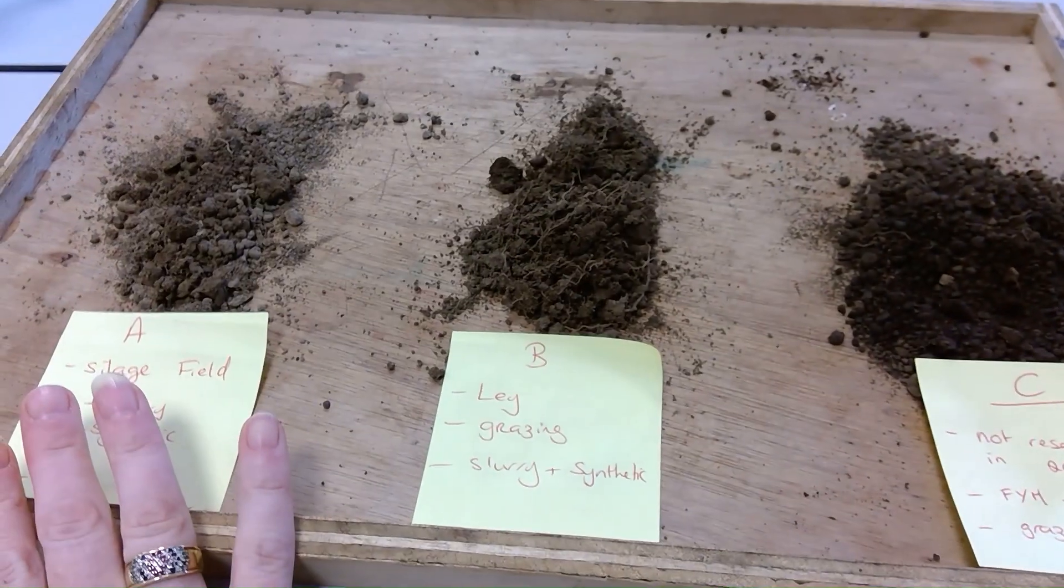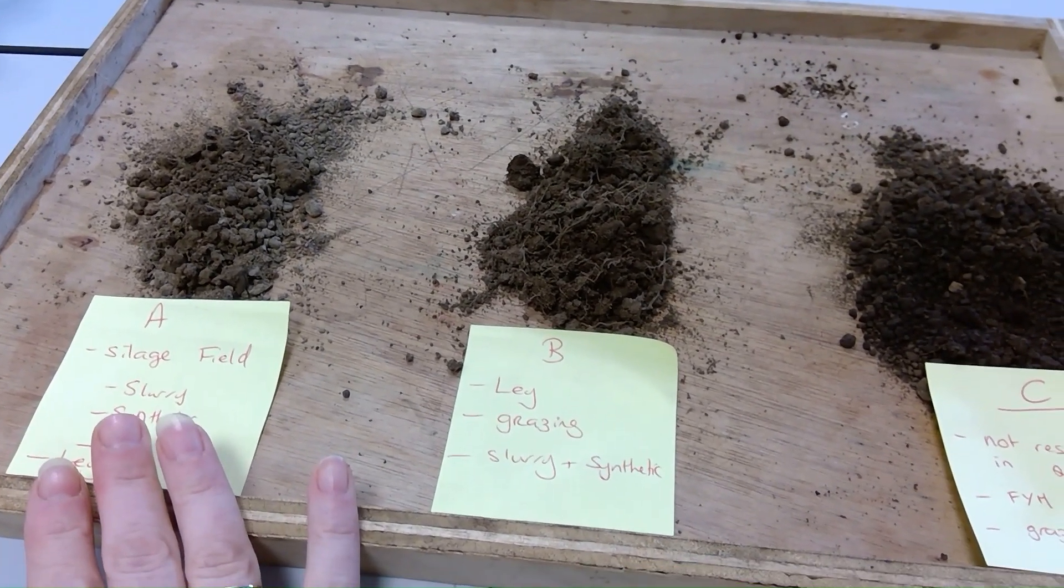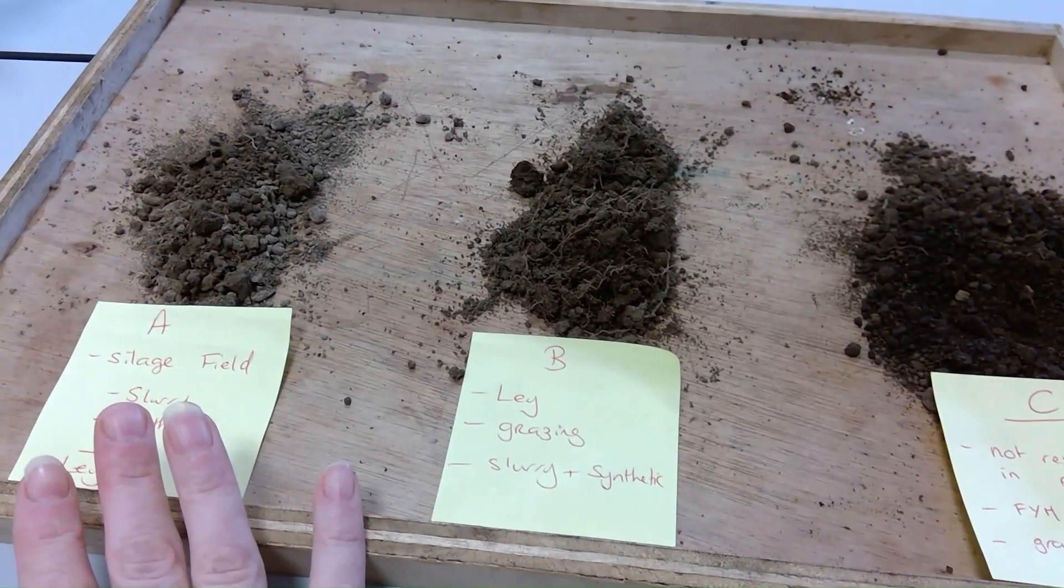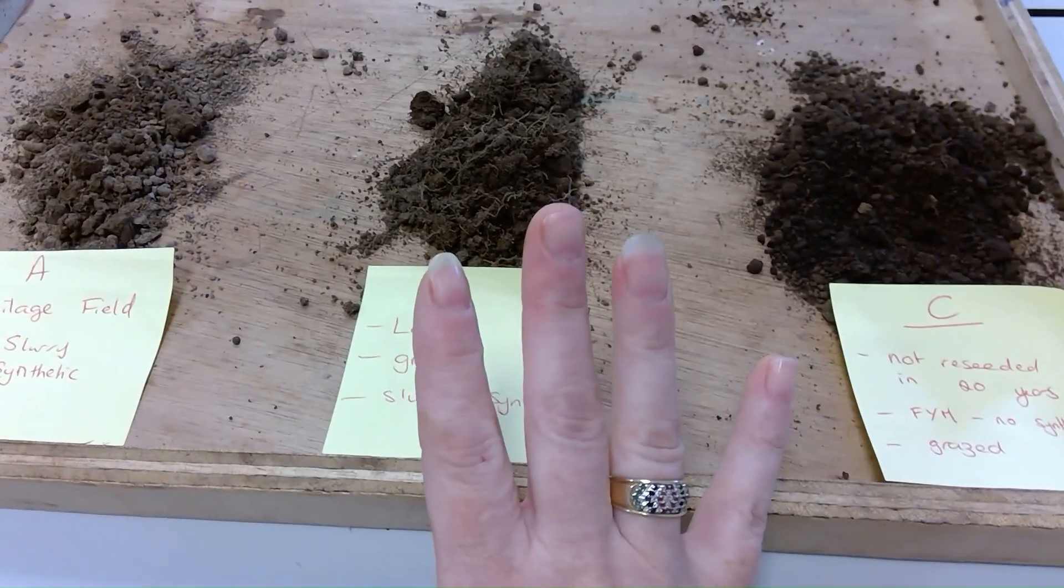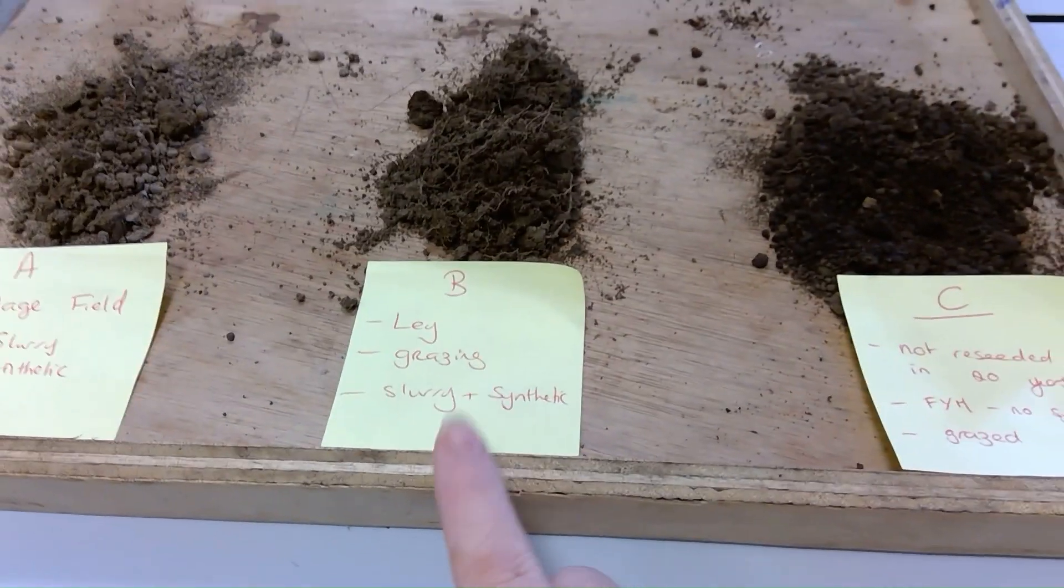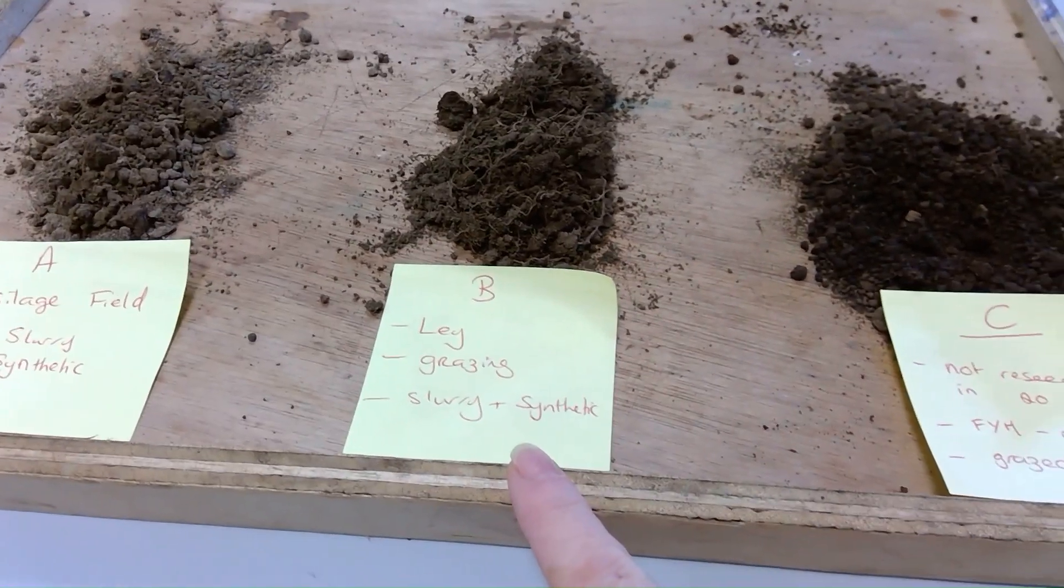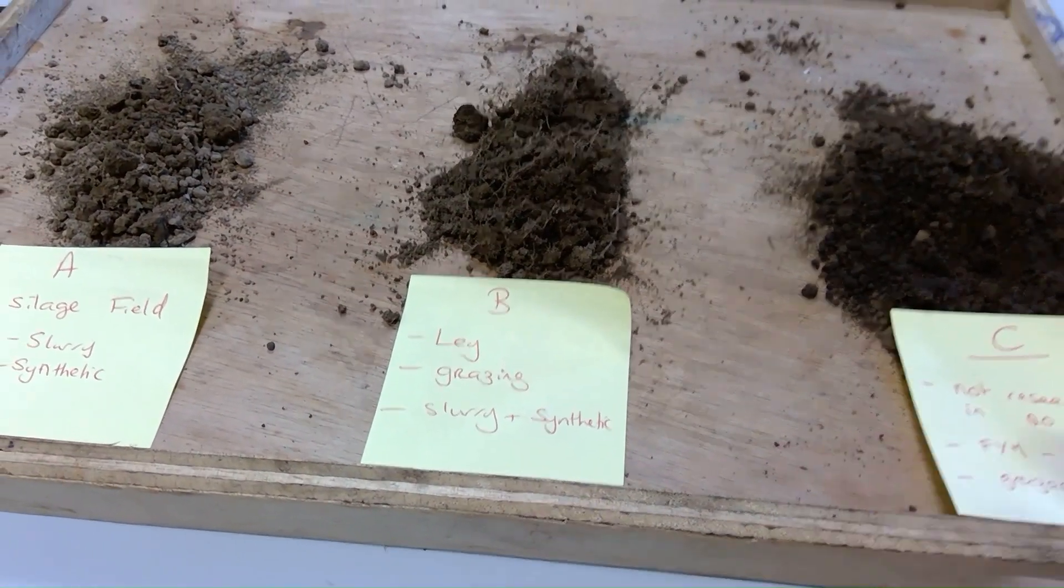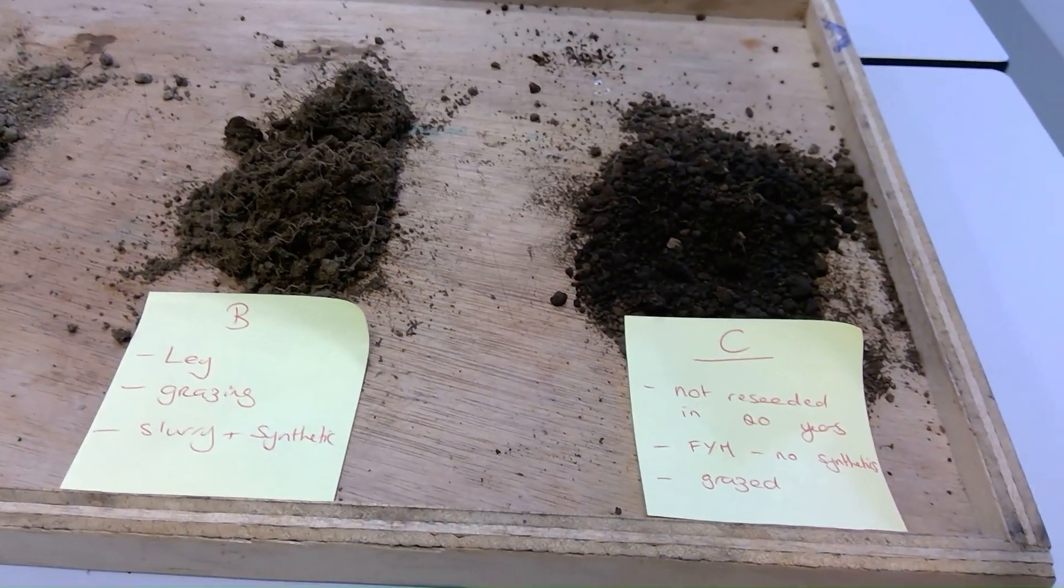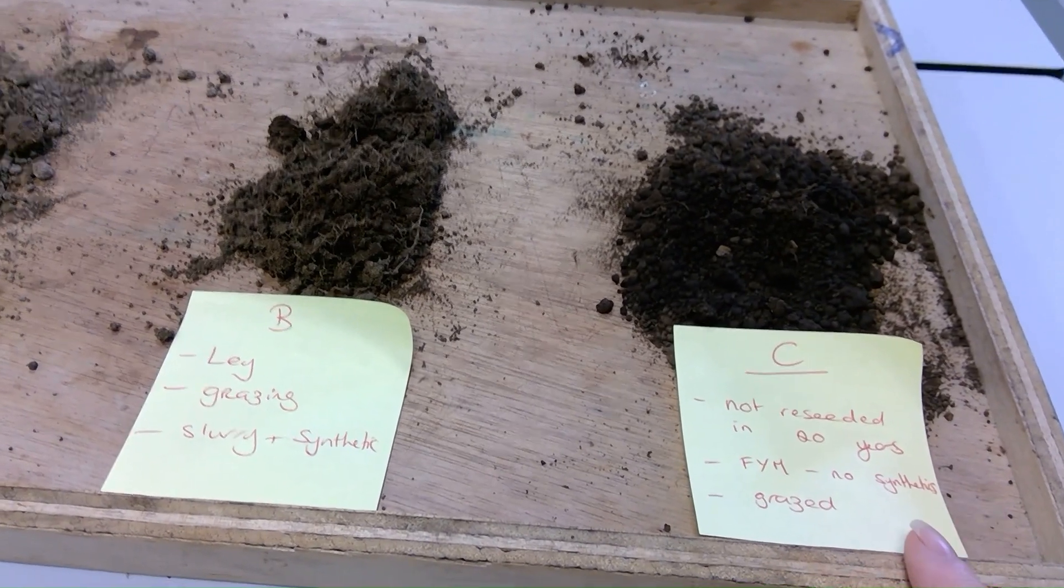So this one here is from a silage field. It only gets synthetic fertilizers and slurry, it's not grazed at all, there's no solid manure going on that ground. And this one here is a lay, it has been recently reseeded in the last four or five years, again synthetic fertilizers and slurry, no farm yard manure.